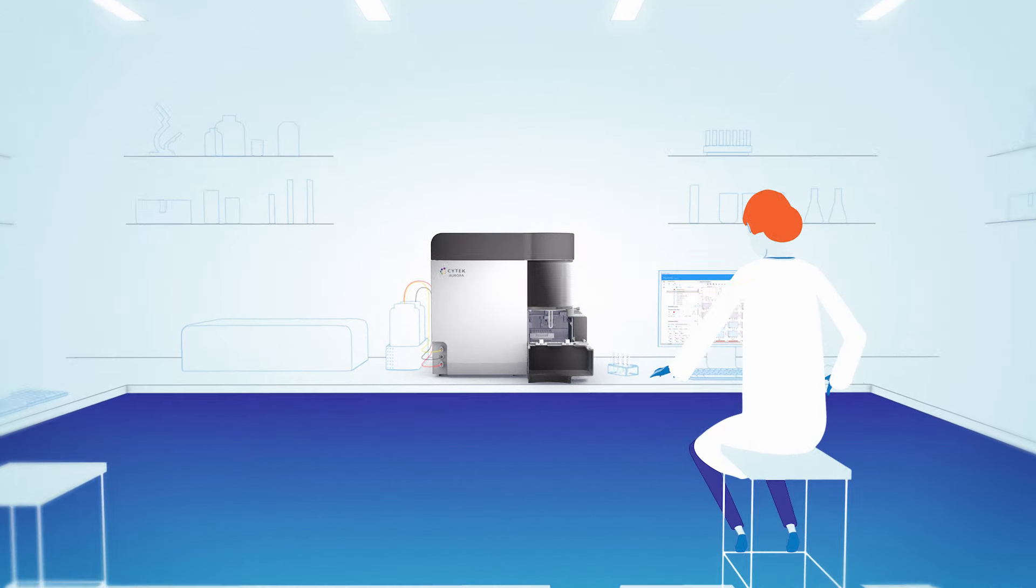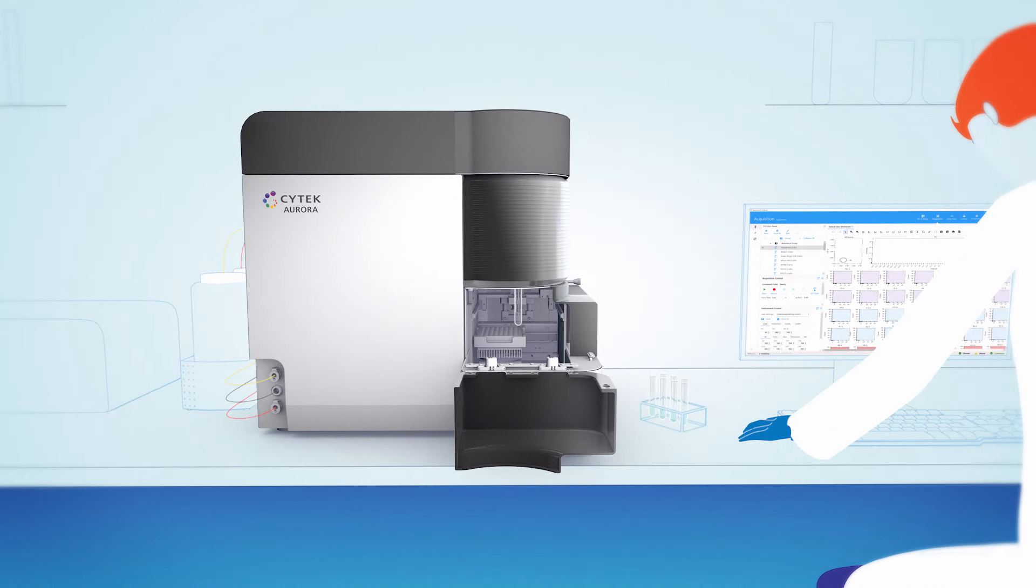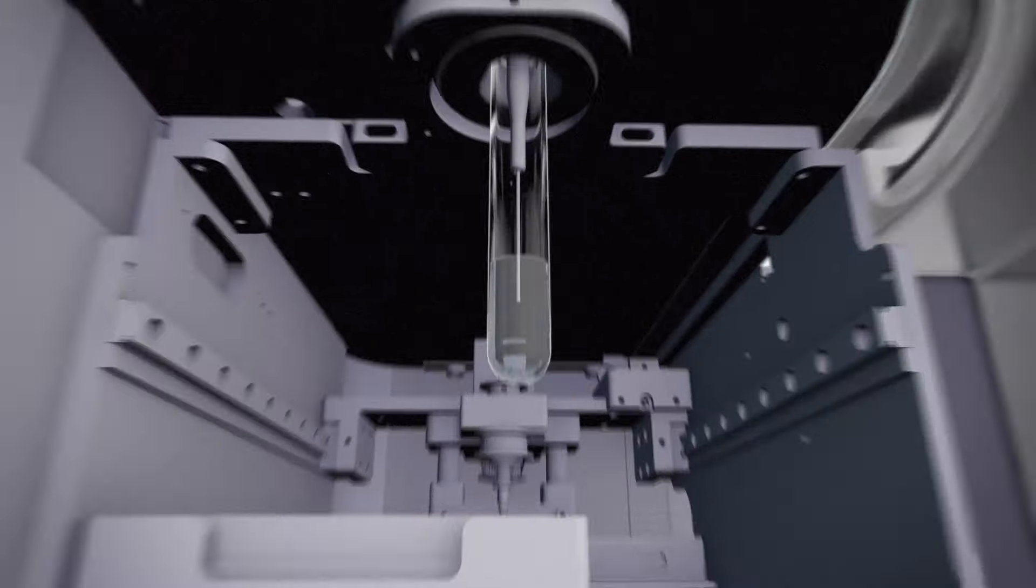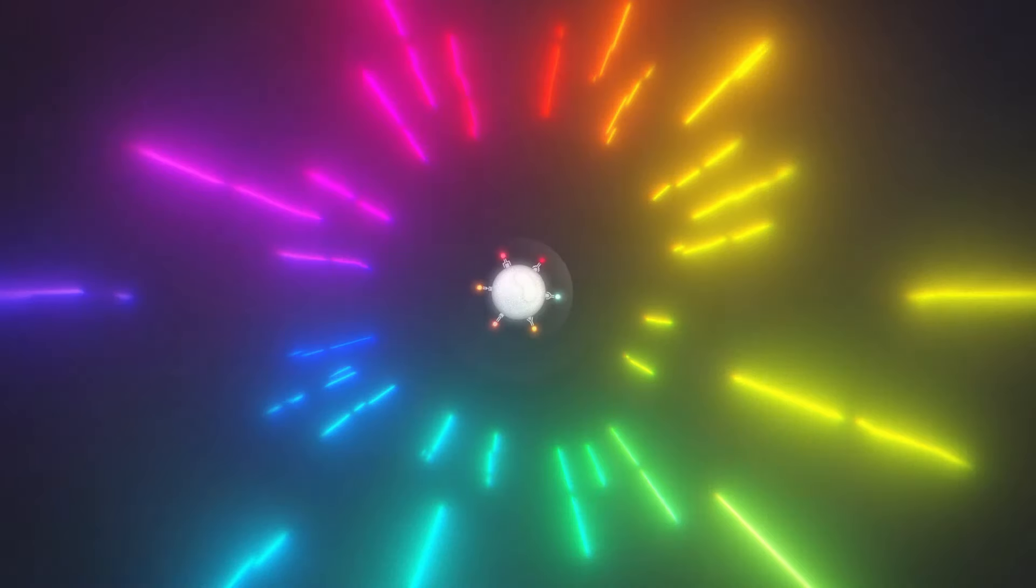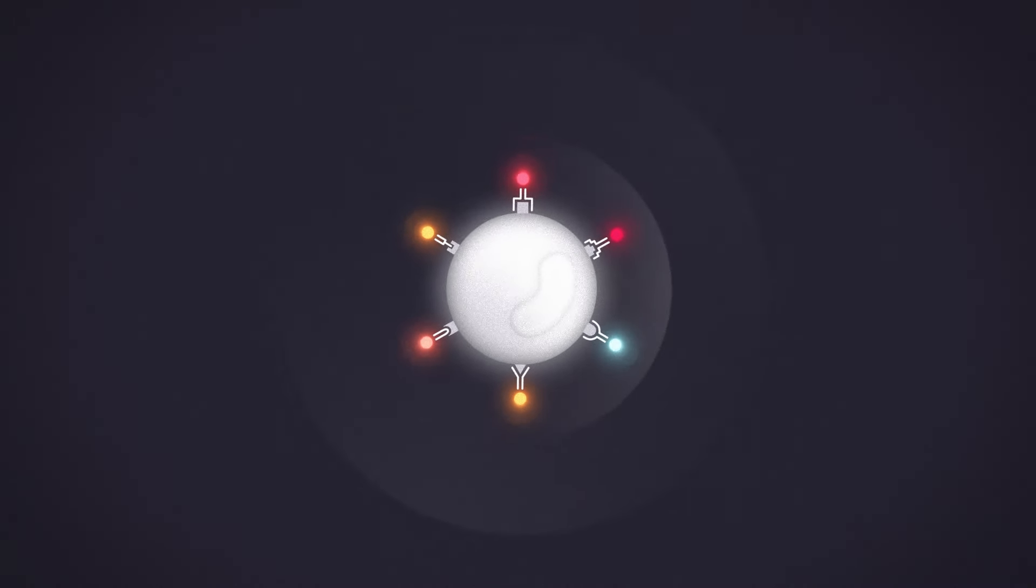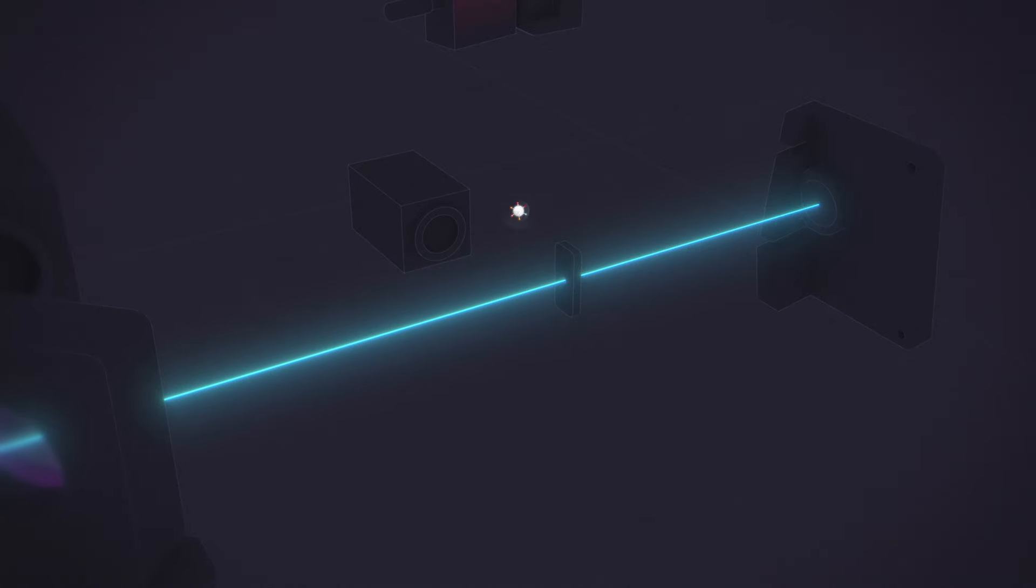The Aurora's Fluidix system is vacuum-powered, allowing you to run a variety of tubes and plates. As the sample moves through the flow cell, relative size and granularity of each cell is measured via forward and side-scatter detectors.